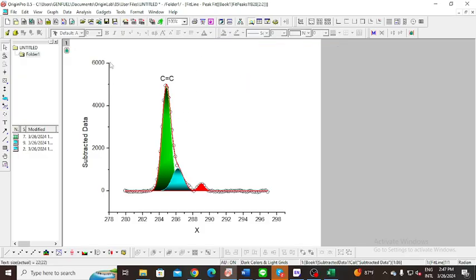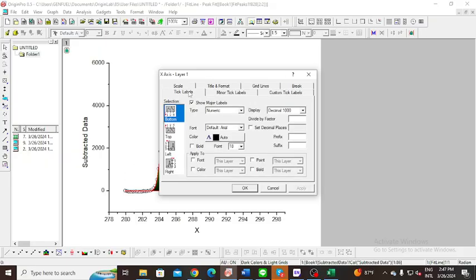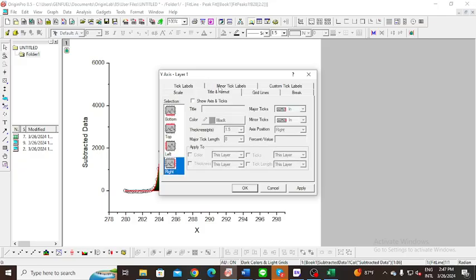To make the graph here, need to double click on the line. It's basically a little bit like the text plot. For this one, right, we uncheck this one, but we choose None because no measures.